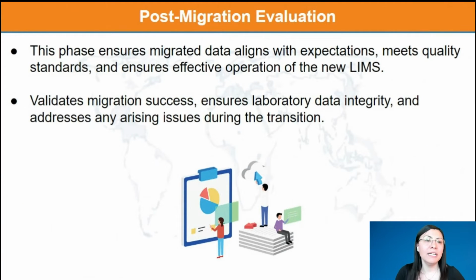During the post-migration evaluation, we need to make sure that the data migrated aligns with expectations, meets quality standards, and ensures effective operations of the new LIMS. This process validates the migration success, ensures laboratory data integrity, and addresses any issues arising during the transition.